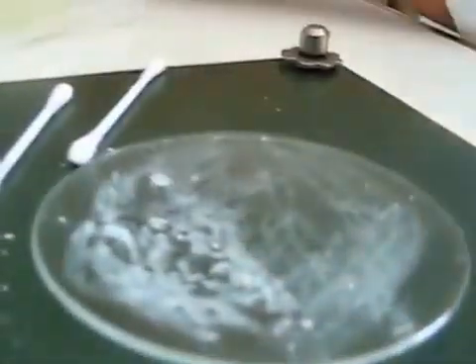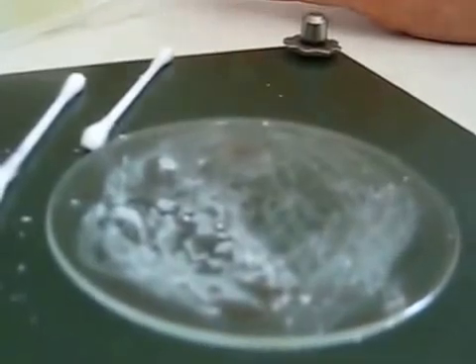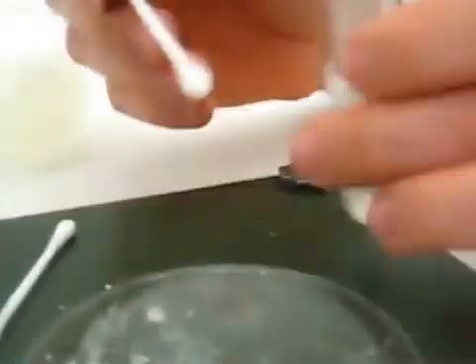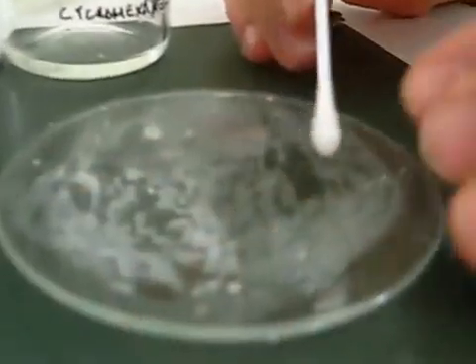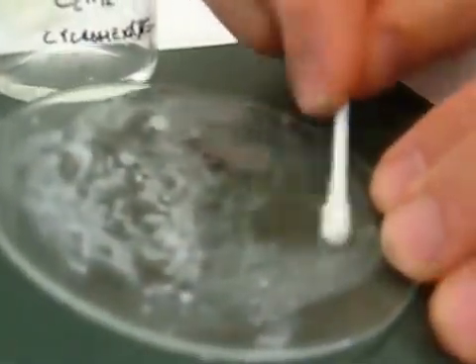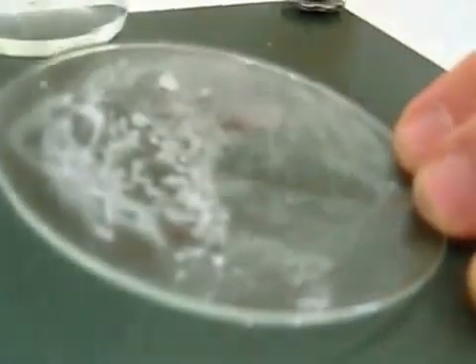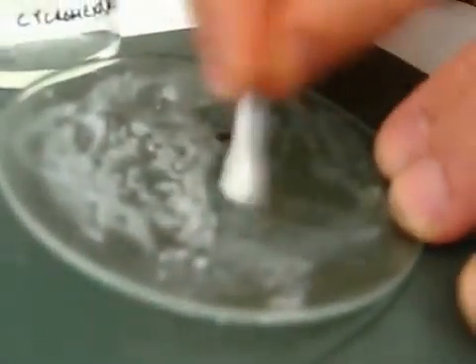Now, let's try cyclohexane. We'll do the same thing with a Q-tip. And rub it in. Now you can tell how it just melts.